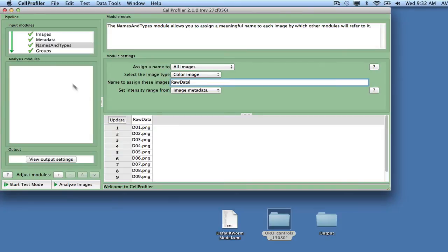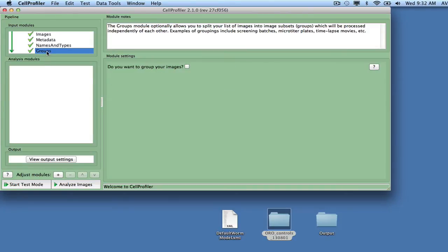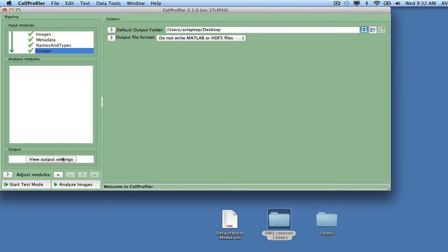The groups module is not needed for this assay, so it can be left at its default setting. In order to load the worm model, you will need to adjust the output settings. Click on the View Output Settings button in the bottom left of the CellProfiler interface, and then adjust the default output folder to point to the folder where you want to store your output.